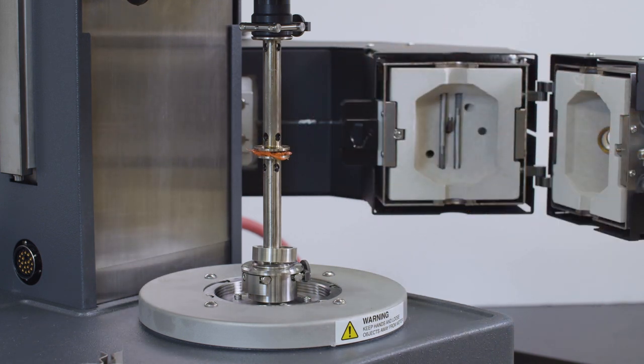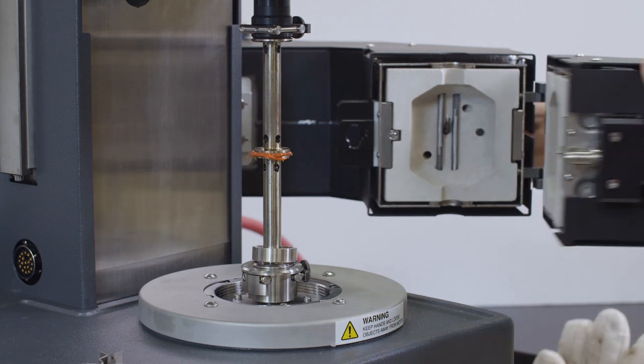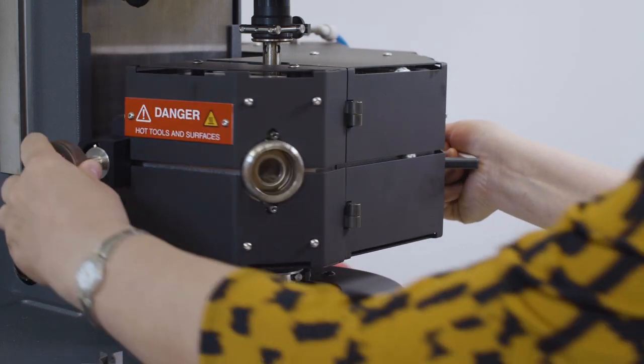Slightly lower the upper geometry until it squeezes the pellet further down. Close the oven immediately.